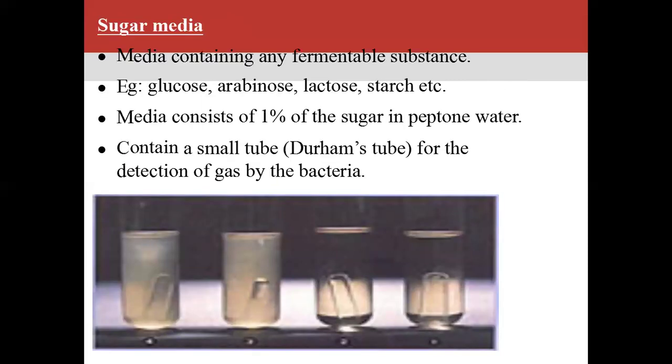So next, sugar media. What is the sugar media? Sugar media consists of any fermentable substance such as sugar, such as glucose, arabinose, lactose, starch, etc. What is the purpose of this sugar media? It helps to check the fermentation test.